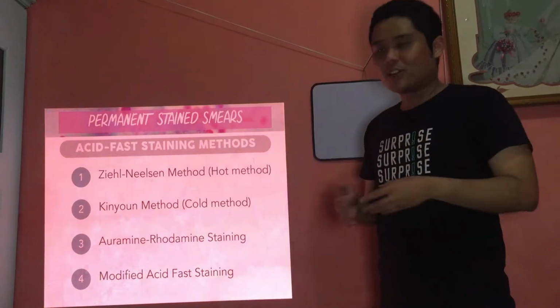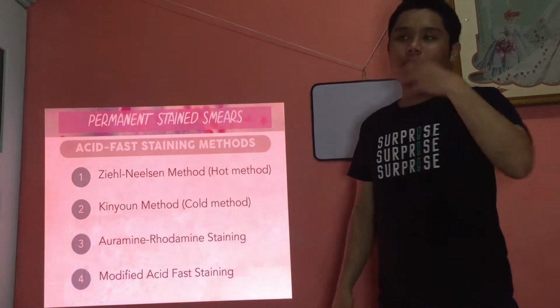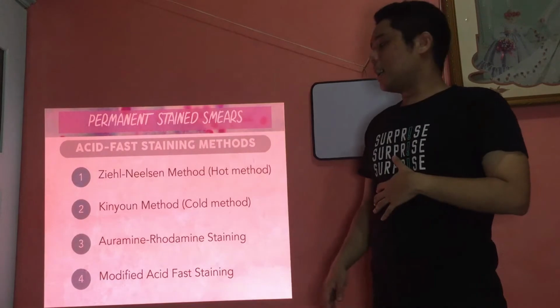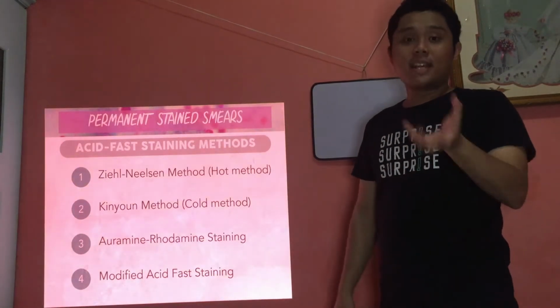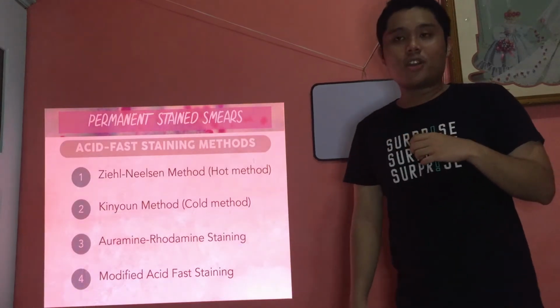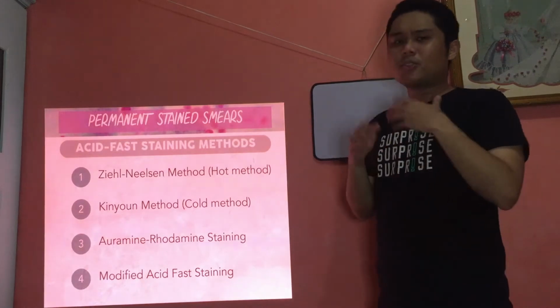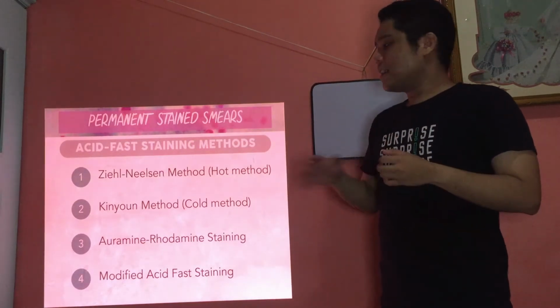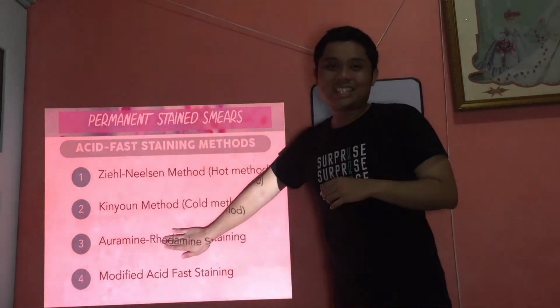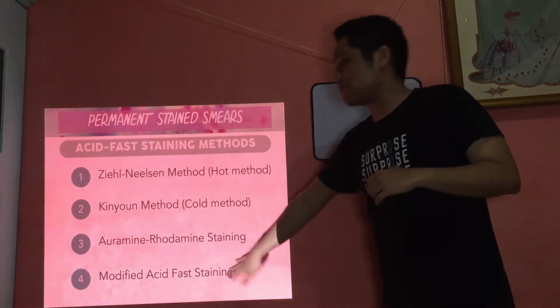So there are a lot. As you can see, there are 4. And the 4th one is what we use for parasites. Because again, the parasites that we are going to stain or look for are the coccidian oocysts. They are, again, as mentioned, only partially acid-fast, modified. But again, so that you can appreciate it even more, we're going to discuss the first 3 methods. Sorry guys, it's not included. I did not include this. Actually, it's only 1 and 2 and number 4.